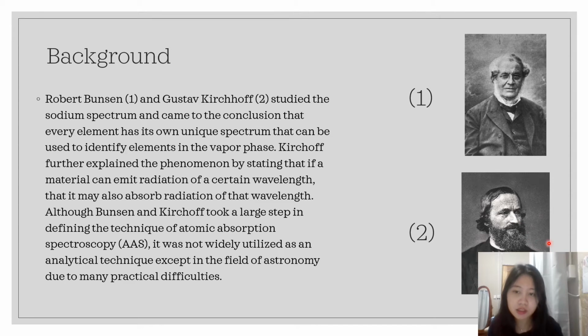And Kirchhoff stated that at a certain wavelength, a material can emit radiation, and at that wavelength it can also absorb radiation. So AAS was not widely used as an analytical technique, but Bunsen and Kirchhoff decided to make a big step to define the technique of AAS, atomic absorption spectroscopy.